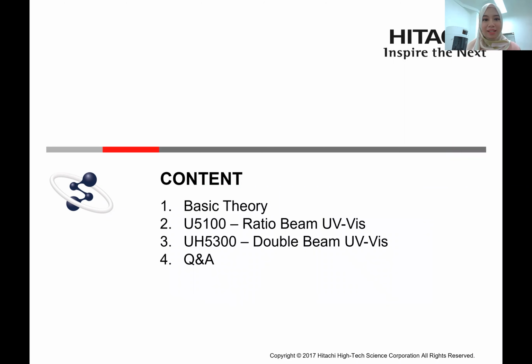So here are the contents we're going to talk about. First is the basic theory, then the ratio beam and the double beam, and we're going to finish off with a Q&A if you have any questions. So let's go ahead with the basic theory.